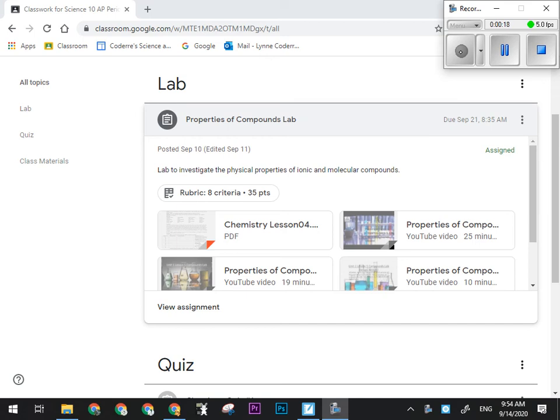Okay, I did the lab, I filmed it all. I used a digital thermometer for all the solubility tests. Everything is really accurate if you want to confirm your data, which is probably not a bad idea. Watch that video just to make sure your data kind of agrees with mine. If it doesn't, then there were mistakes made along the way, and that can happen. It's not a big deal, but this will help to make sure you have the right data for the analysis.